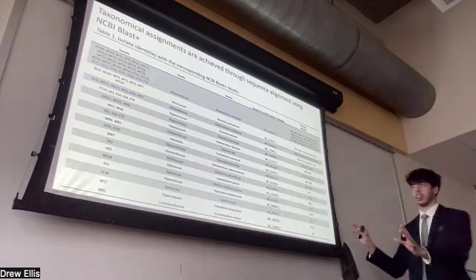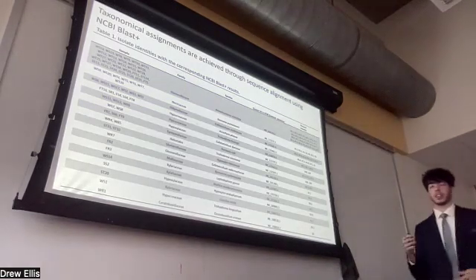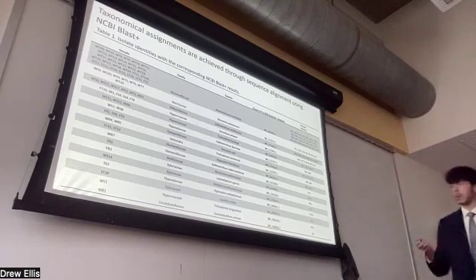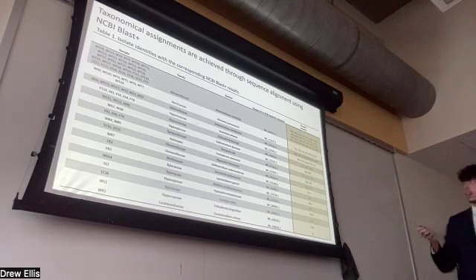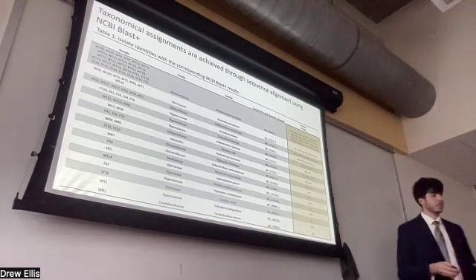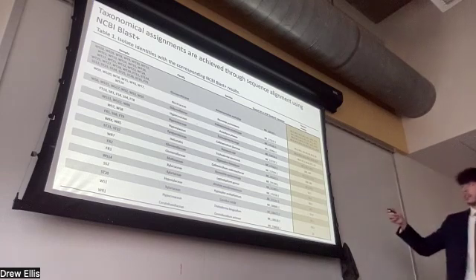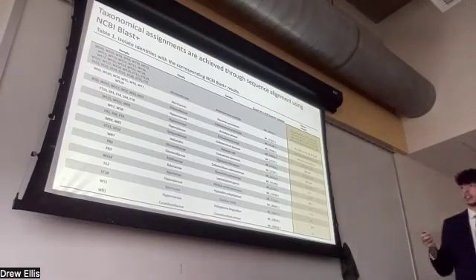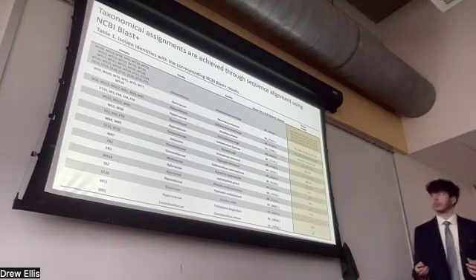This is a big table of a lot of information that you don't really need to know. So I'll showcase some specific information from it. This is representing our 67 isolates that we saw across 3 different seasons for all the different types of tissues with assigned species from NCBI. And with the assigned species, this is the alignment that we had from the ITS 1 to 2 region that was sequenced. What that means is just what's the overlap that we're seeing in these sequences and the type specimens. And if anyone's not familiar with it, typically there's a standardized level which you want the sequence to be to assign an actual species, and we're not seeing it at that level, just indicating that we're isolating something specific that hasn't been described before.